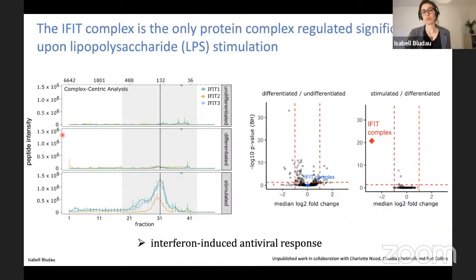What we usually see is that in the very early fractions, there are lots of proteins eluting, and they might be membrane associated or specific to smaller organelles, for example, the lysosomes. And so a really good resolution you will get only in the middle part. So yeah, the high molecular weight range is more tricky.